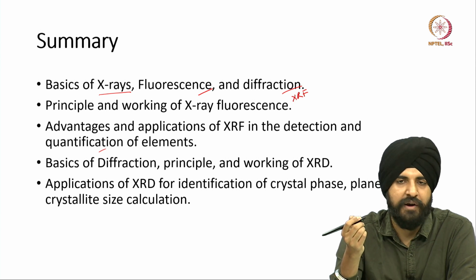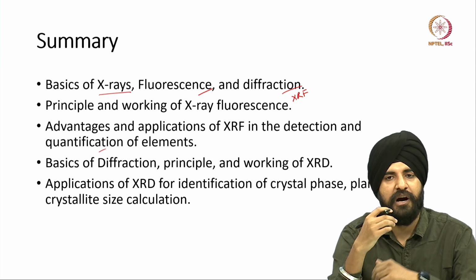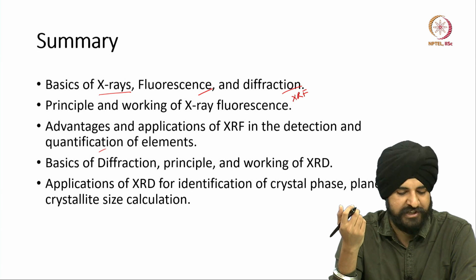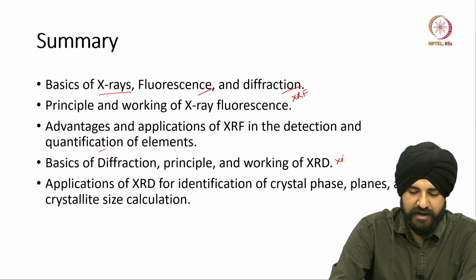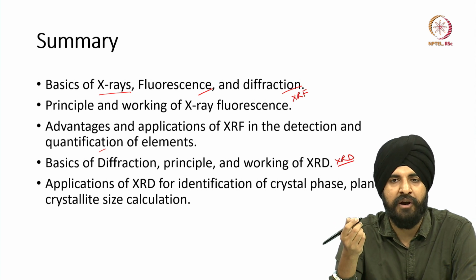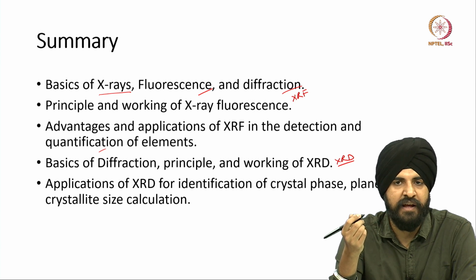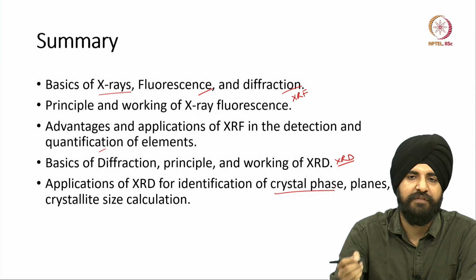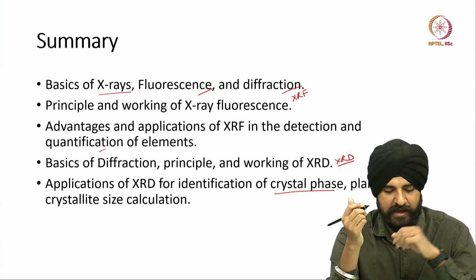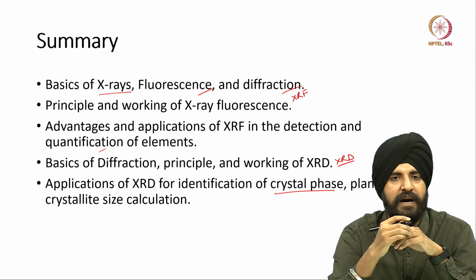Then we talked about the basic principles of diffraction, what diffraction and interference are, and how we could utilize the diffraction phenomenon for our characterization and in our XRD. Then we talked about the basic principle, mechanism and working of the XRD as well. And we talked about some of the applications of XRD like identification of crystal phases, calculation of crystallite size, identification of the planes and identification of the impurities that are there in the sample.